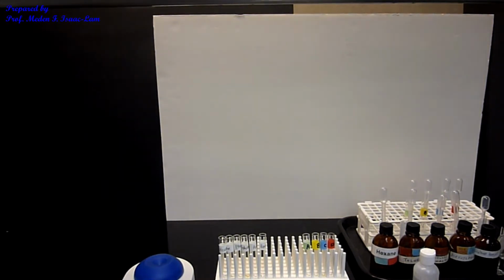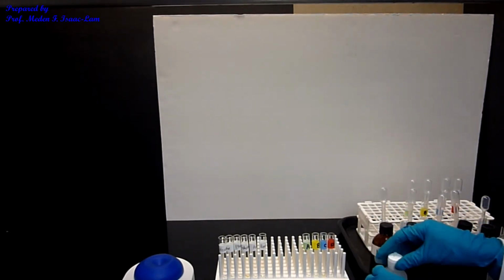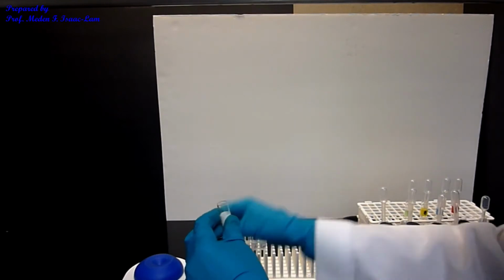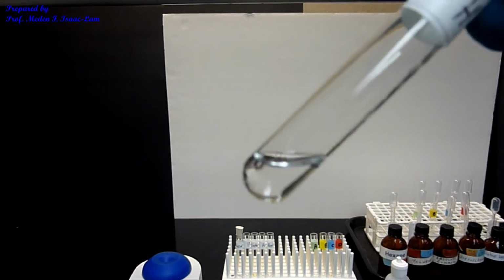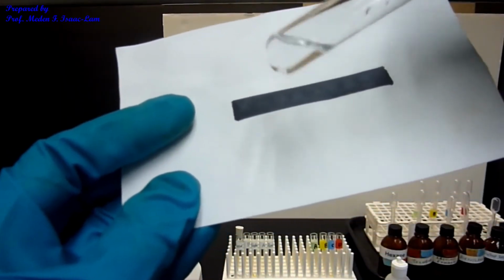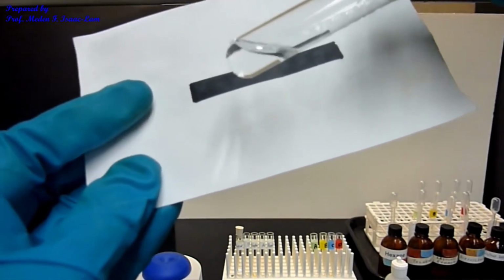Okay, so I already put all the samples, 8 drops each. And then as well as the unknown, I'm going to put now 6 molar hydrochloric acid. So 8 drops. And then we're going to mix it. So this is hexane with 6 molar hydrochloric acid. And as you can see, there are droplets on the side and they don't mix. So that means it's insoluble.